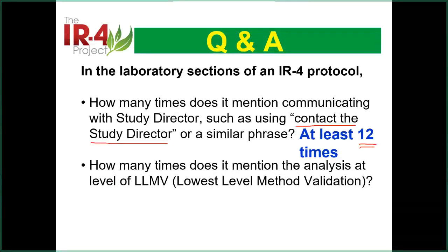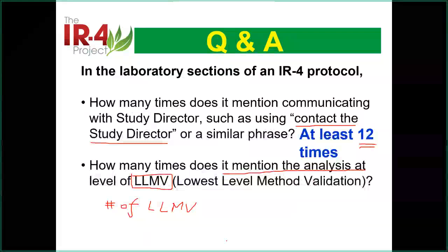Next question: how many times in the protocol does the analysis talk about having to do LLMV? And another question: how many LLMVs do you have to do? The number of LLMVs. This is an EPA requirement. It's not in the GLP, but it's in the protocol and it's an EPA requirement.